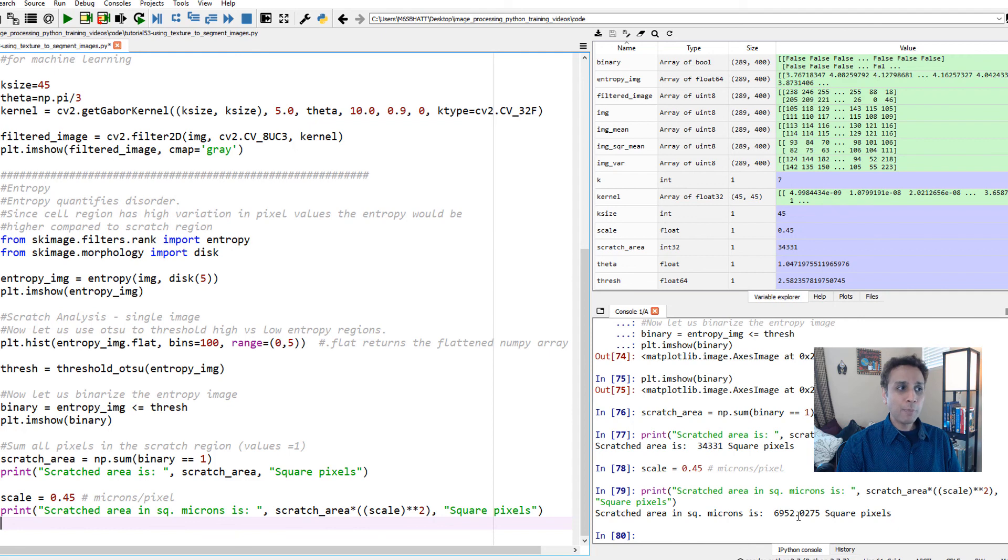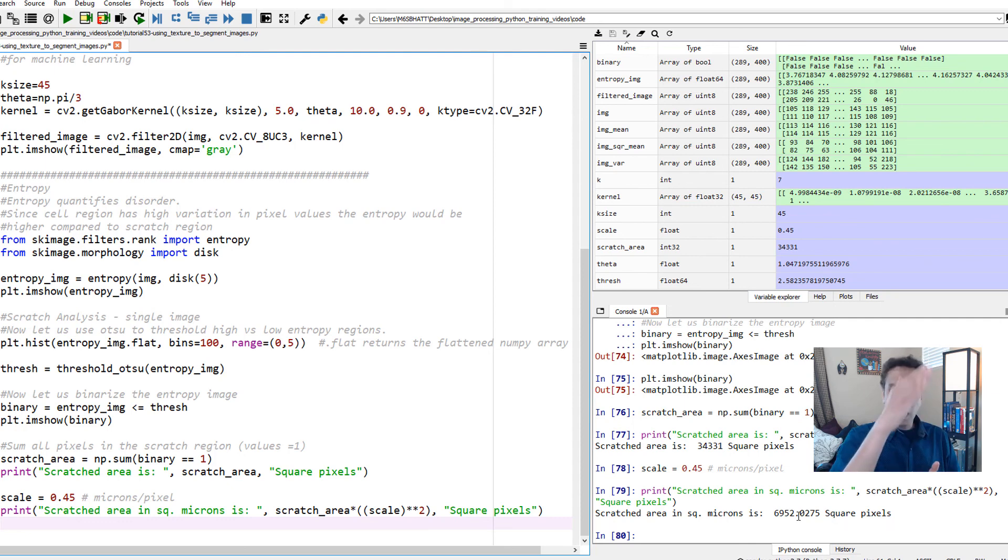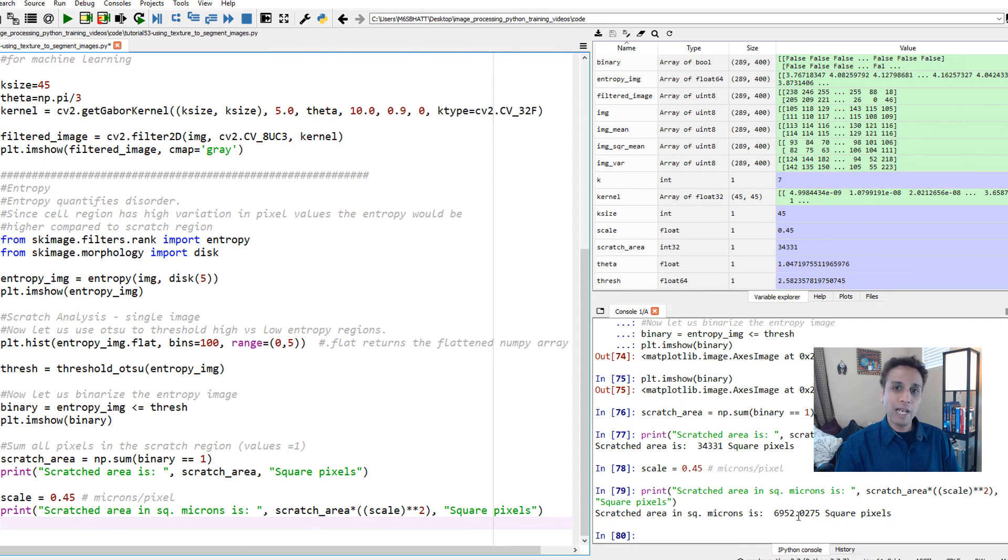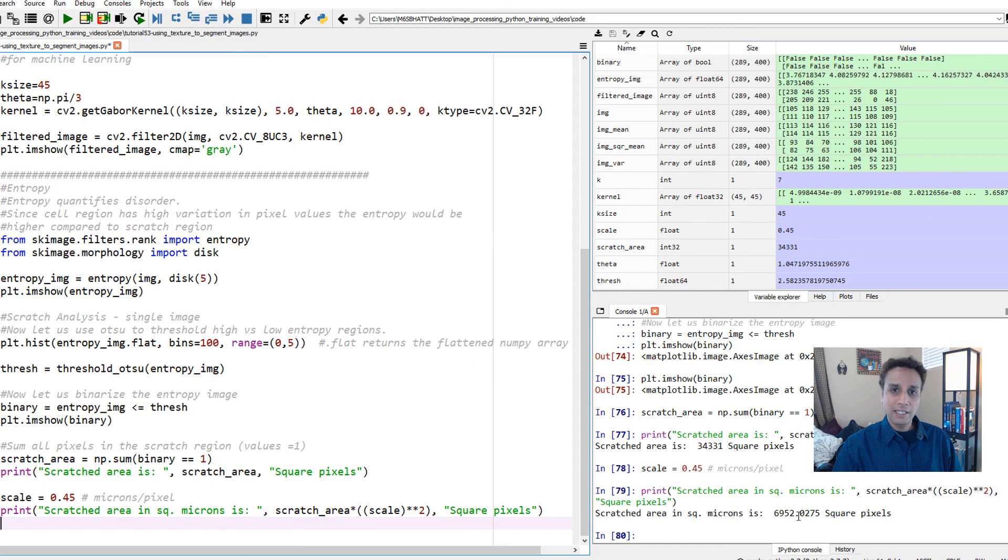Let's build on this in the next tutorial and read in a whole bunch of images as part of time series and plot scratch analysis graphs, which is area as a function of time - which is our scratch assay or wound healing assay.